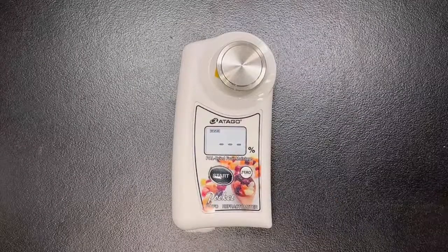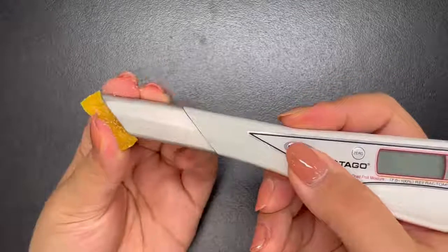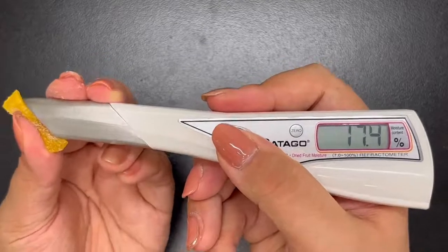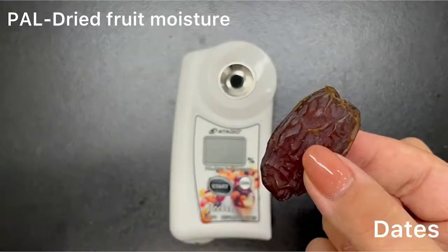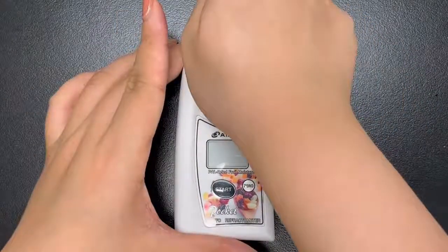Now let's see mango. Mango measures around 17.8%. Sometimes the measurement value between PAL and PEN differs — this is because, especially with the PEN, it depends on how strongly you press it or which part of the dried fruit you are measuring. However, the difference between PAL and PEN is normally within 1%.